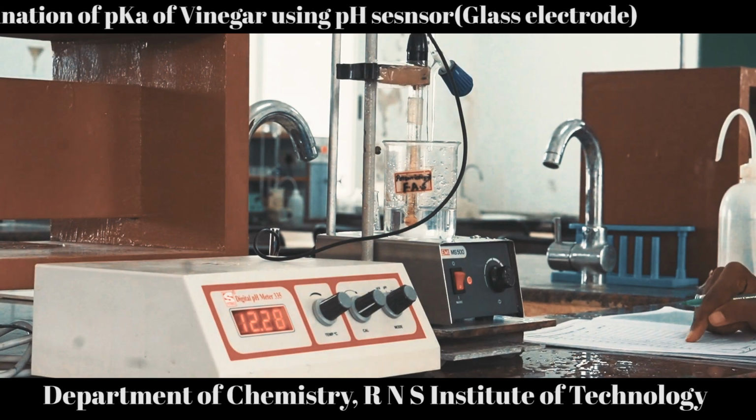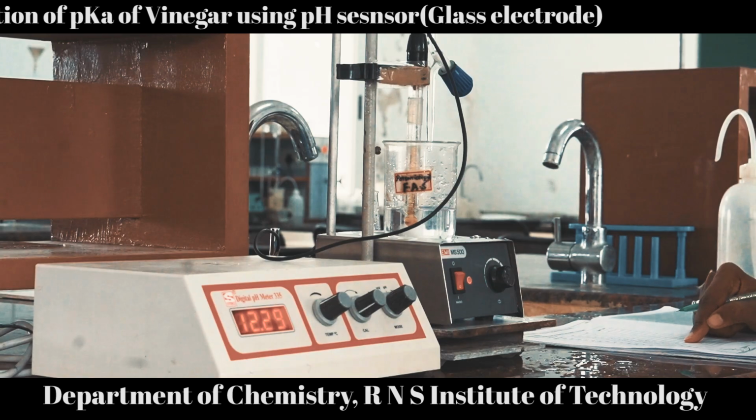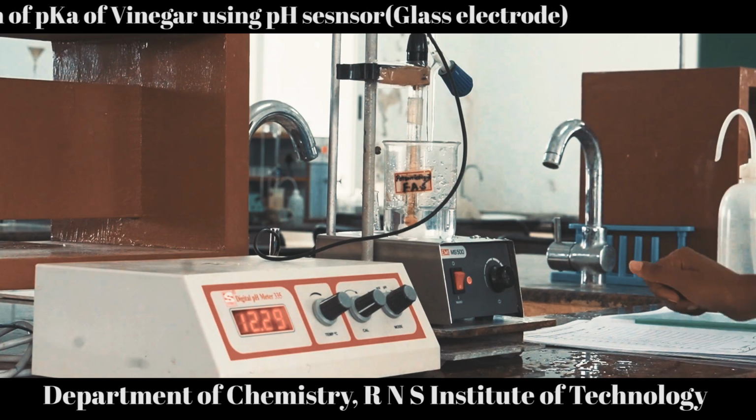Now 5 to 6 readings are recorded. Now we can stop the titration.